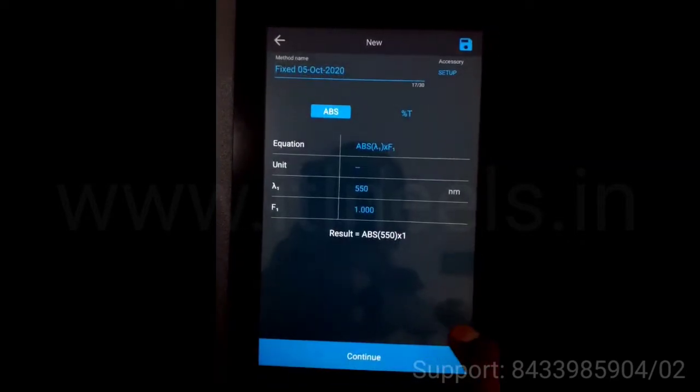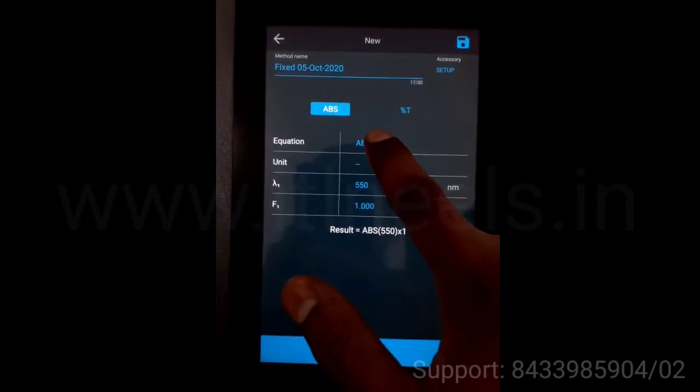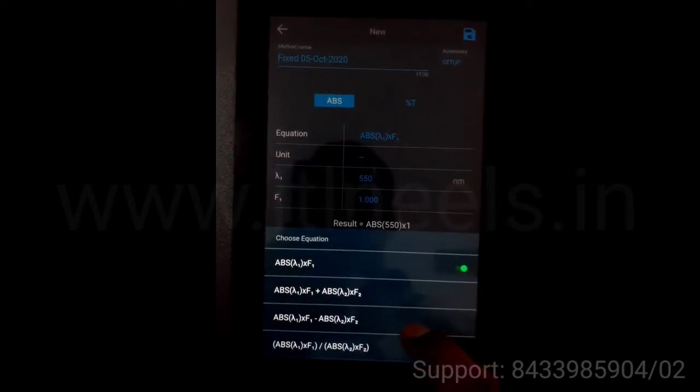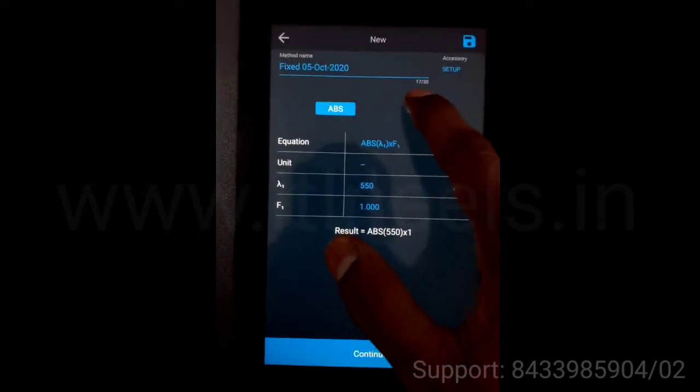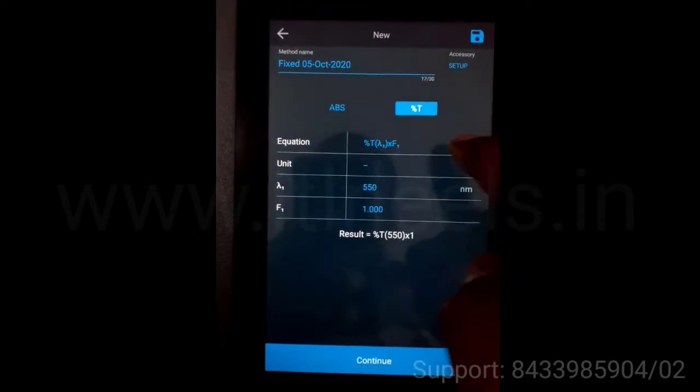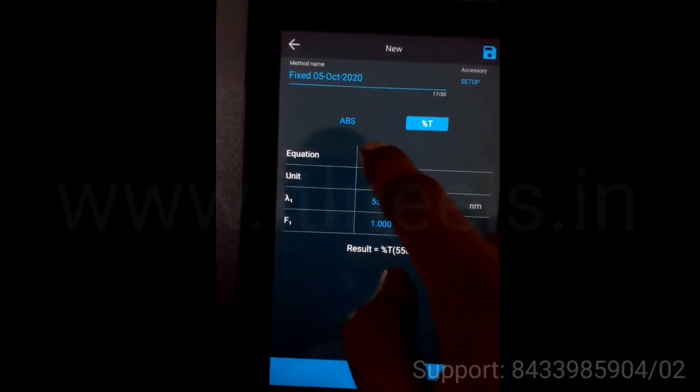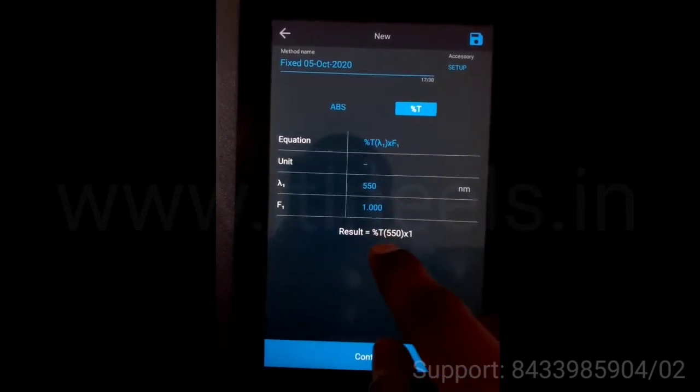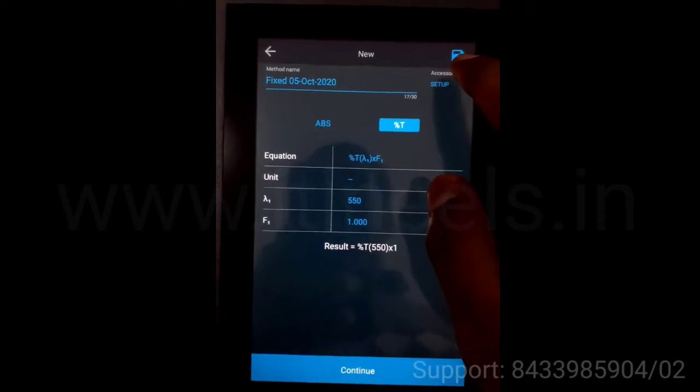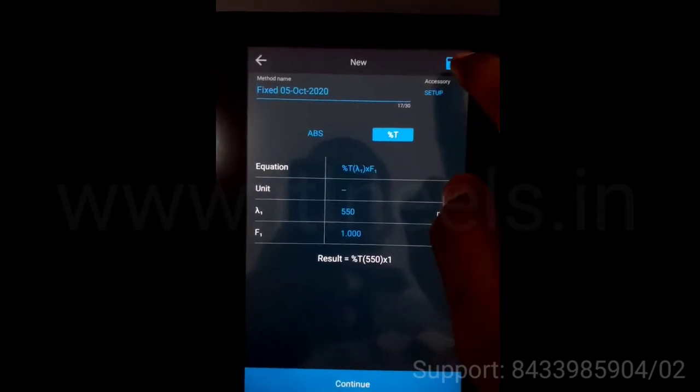To create the method, you can change the equation over here. You can change the absorbance or transmittance. You can change the resonance and the factor as well. You can save the method by pressing this button.